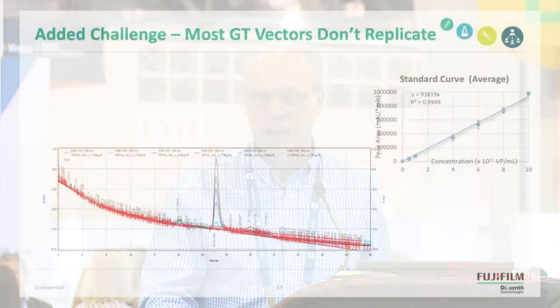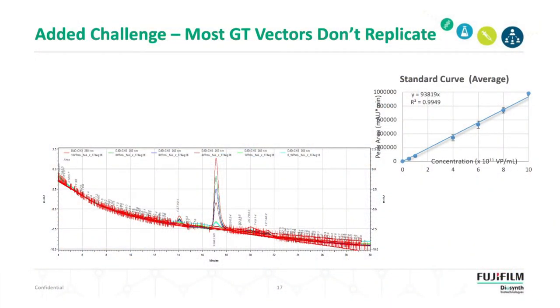So this is a dilution series of purified virus particles on an HPLC. And so you can make a nice standard curve. And then when you've got your unknown, of course, you can apply that and work out what the concentration is. So that's a decent way of doing it. That's quite a nice method. It requires very pure material, because otherwise you'll get a lot of other signals in there, which is very difficult. So it only really works for final purified material.